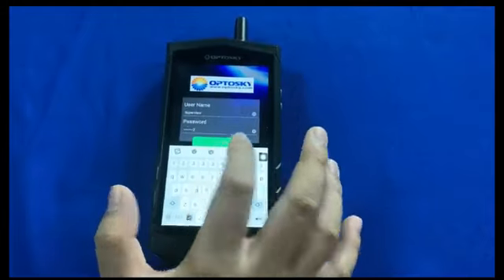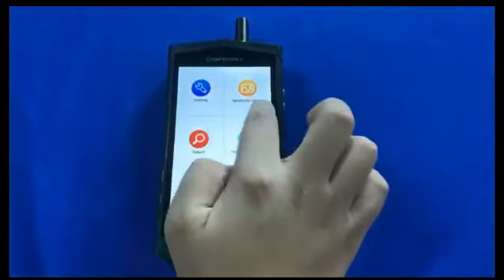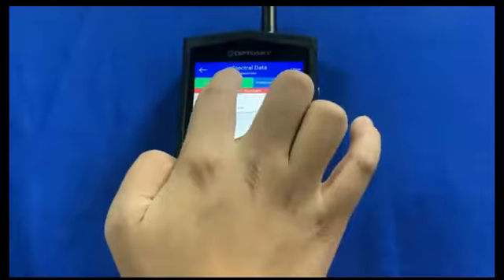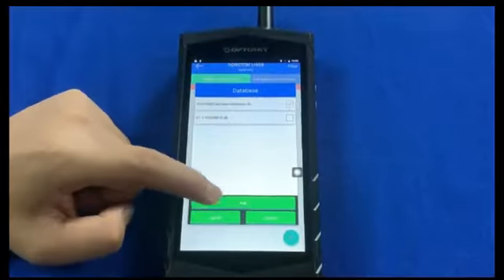Paracetamol is created under the new library name of test lab, and you create the scan method, and you add a method name, scan.